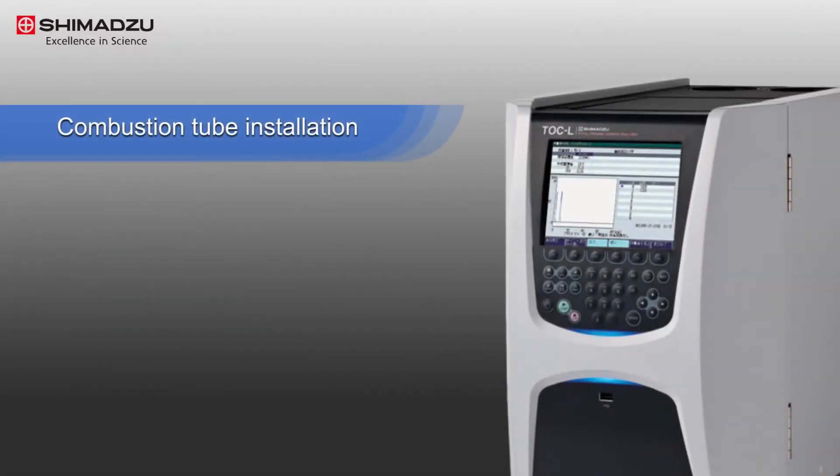Here, we will demonstrate the steps to installing the combustion tube. Similarly, operate this procedure when the temperature of the electric furnace is at room temperature.